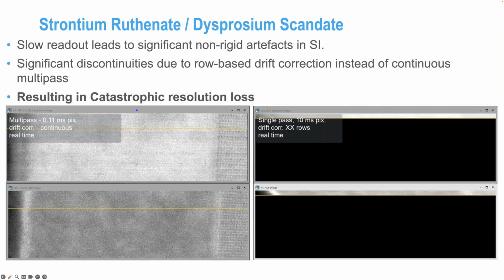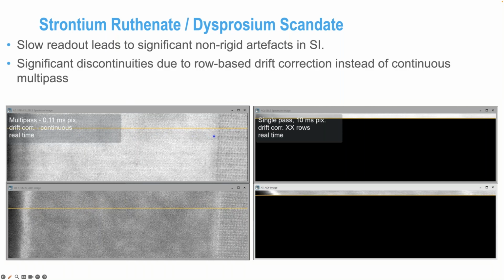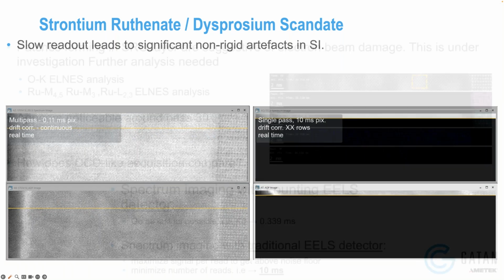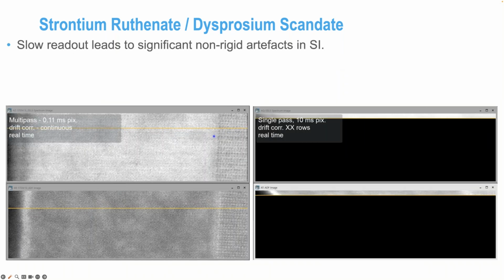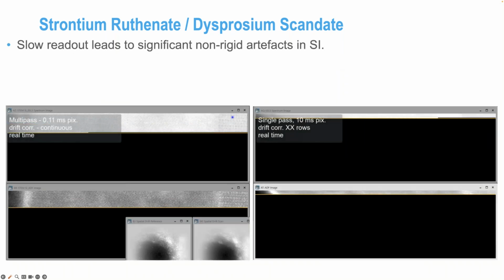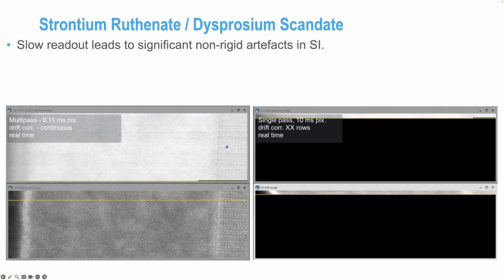This is a good test case for this as well. Like this stellar example, where we were running at 9,000 spectra per second, this data was much easier to process because it's 3 times faster.